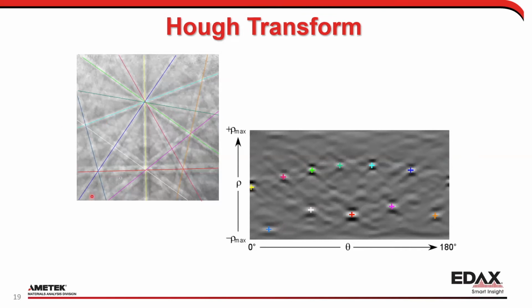So here I can see a little bit more of this light blue guy over here. Actually, I think it's this one here. So I have like 3 different blues on here. Should be this guy here. Here's this guy over here. Here's this big white line. Is this over here? And you can see they're not even symmetrical. But again, they're just finding the middle of the line. And this is really what we want to see here: how well the Hough is doing.